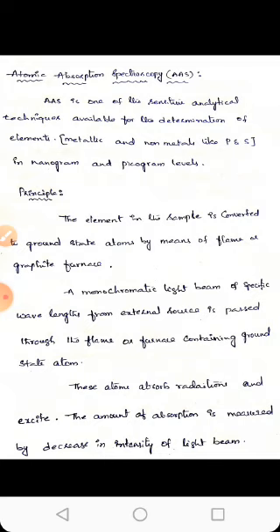Then coming to the principle, the element in the sample is converted to ground state atoms by means of a flame or graphite furnace. For that, a monochromatic light beam of specific wavelength from an external source, like a hollow cathode lamp, is passed through the flame or furnace containing ground state atoms.